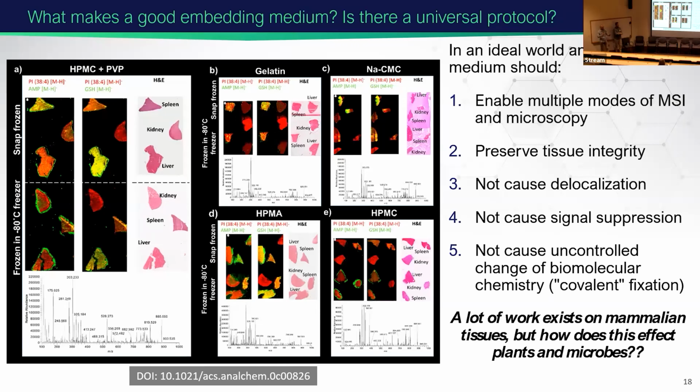If you're really interested in that, we should go to the next workshop where I will cover that more deeply. If you want to see what kind of samples we accept, this is more about theoretical details: what is necessary for good sample prep and why it's important to do sample prep that way.